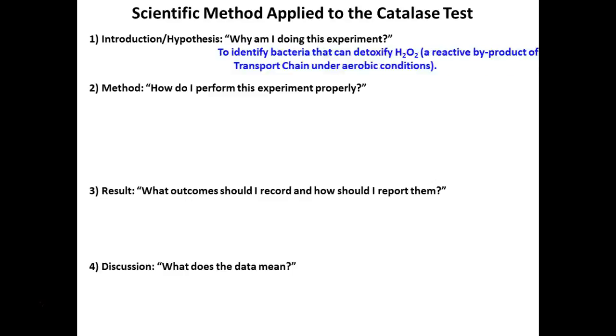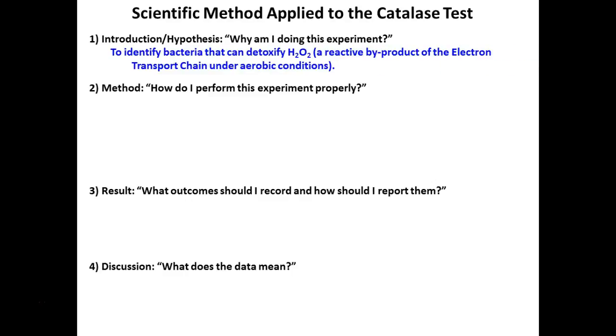All right. So this is important. These scientific methods, although I've been kind of breezing through them, you might want to go back and look over because it's an excellent summary of everything we've done, right? So why are we doing this test? Well, we want to know, does your organism have catalase? Does it have an electron transport chain where it can transfer electrons to oxygen?